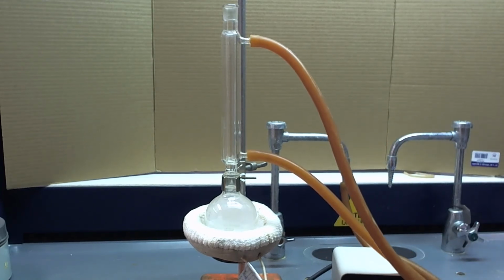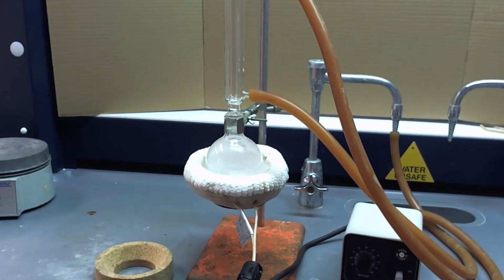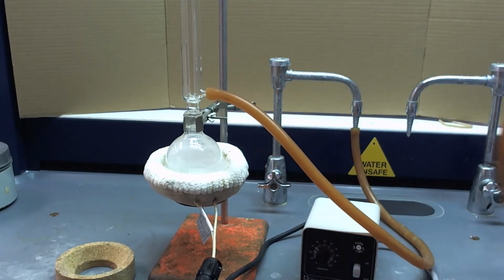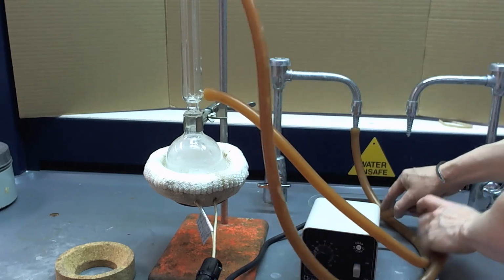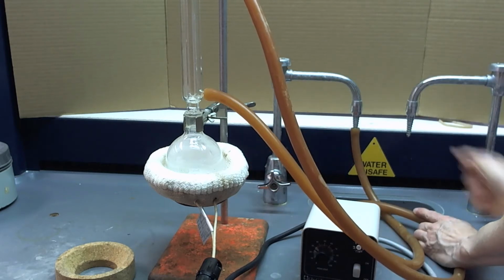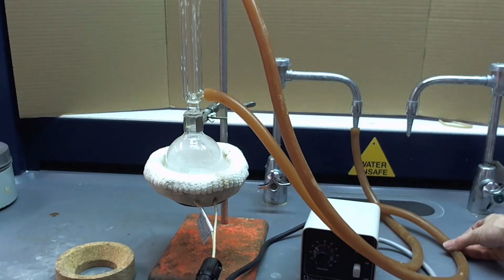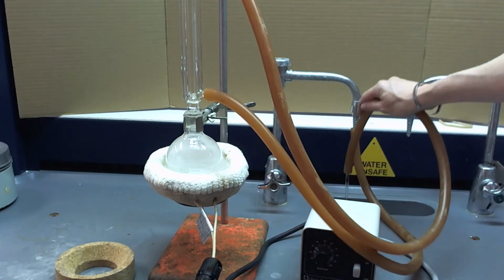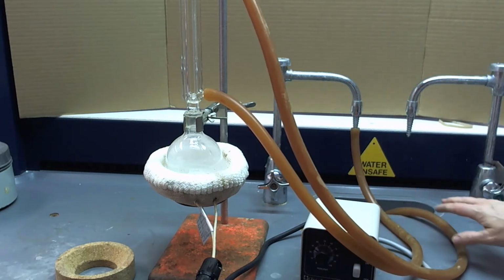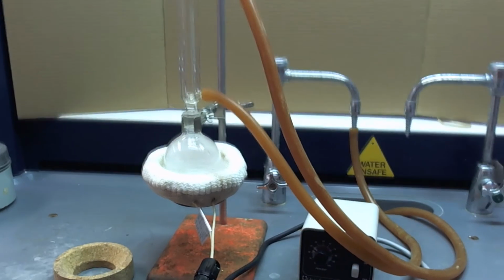Now we're close to being ready to heat our system, but let me show you how to get that water on sort of gently. You want to take this return tube, the one that's going down the drain, and hold on to it as you gently turn the faucet on. You just need a little bit of water. And see how it's filling my reflux condenser? Just gently, I have a little trickle coming out that return tube, and I just leave it like so. So holding onto the return tube while you turn the water on is helpful to avoid a problem.